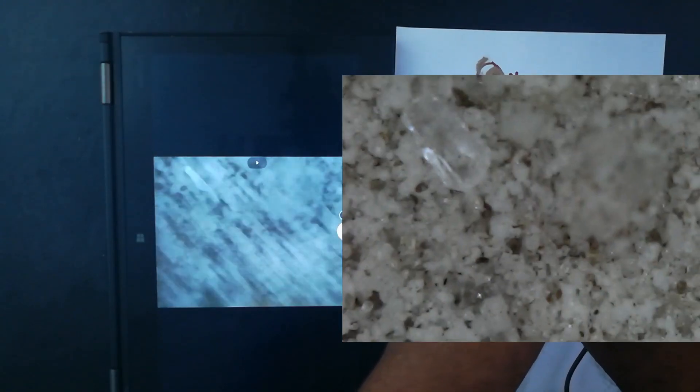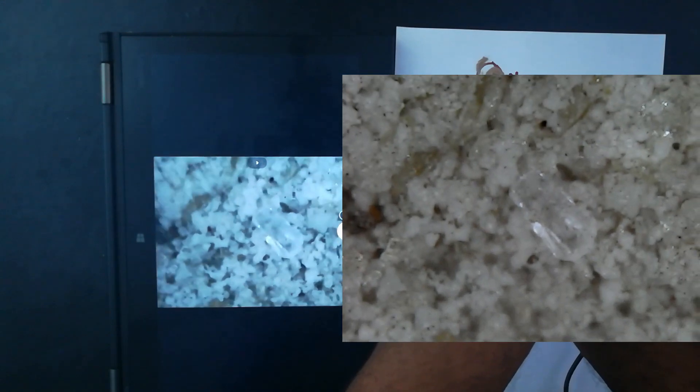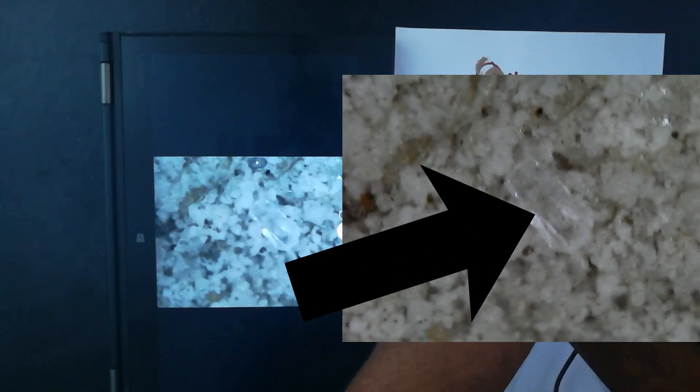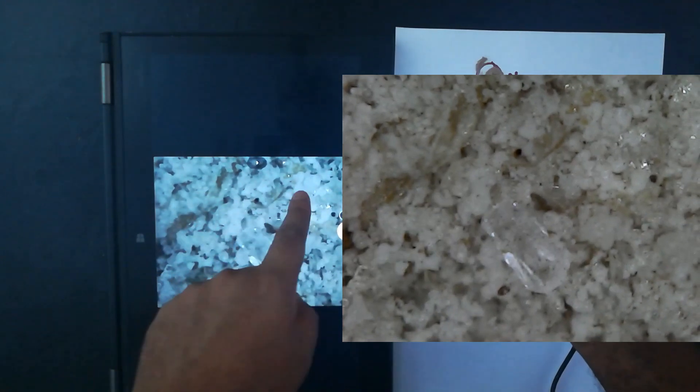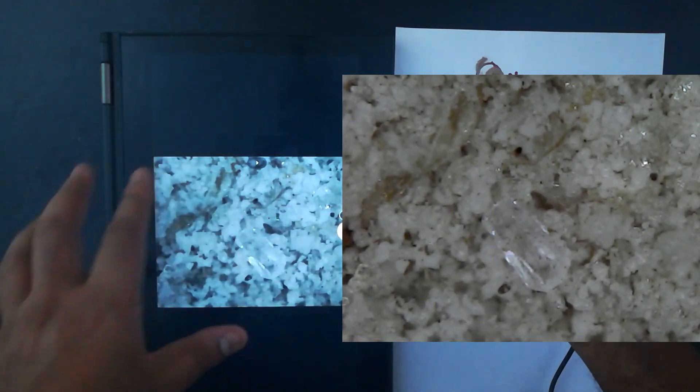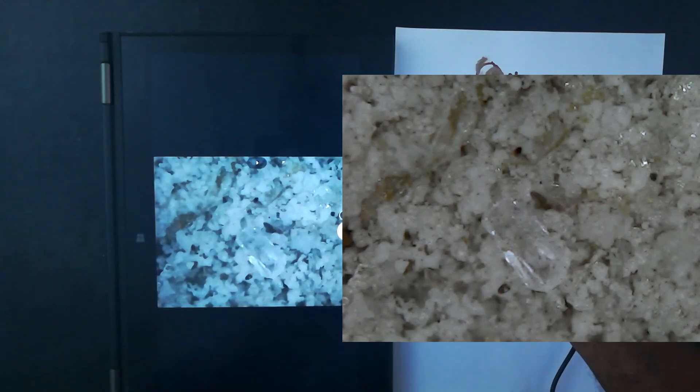So even the pure one has it. And it's kind of everywhere if you look at it. See? See? You can see, right? It's just reflecting all over. Small, small reflections. And Nutrimed has it. I just showed it to you. And the biggest dominant thing is this Beginner's Whey. Oh my god. Look at this chunk. Look at this chunk. See? What the hell is this thing? See? And these yellow strips. I think the yellow is a binder. I understand that. Because all the whey protein is kind of surrounding it. But what are these crystals?